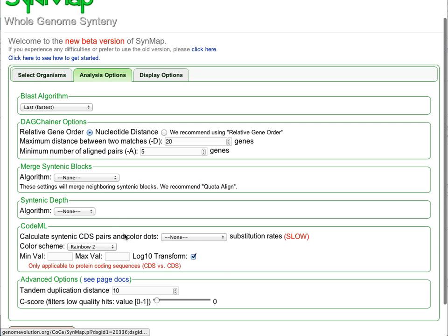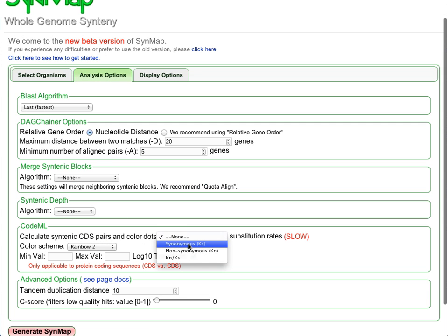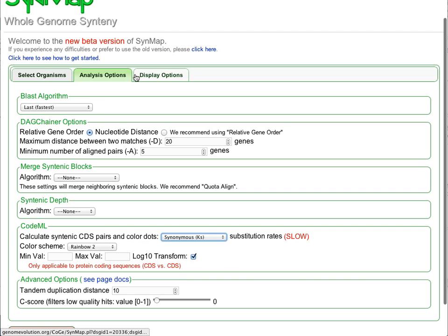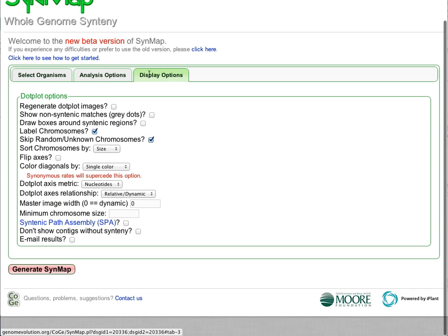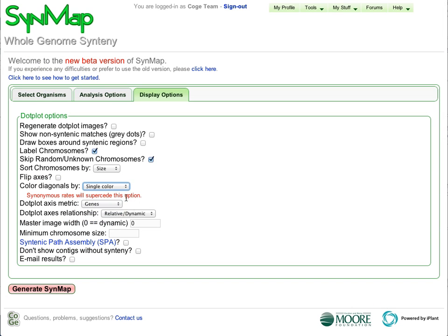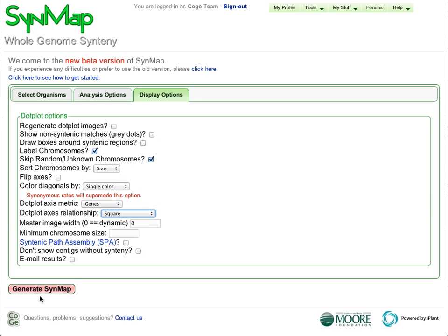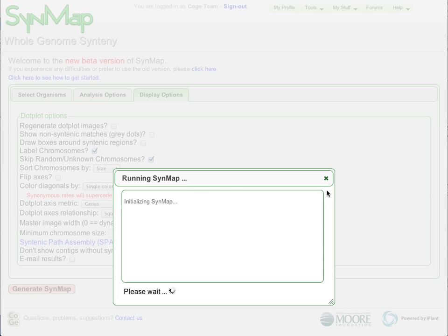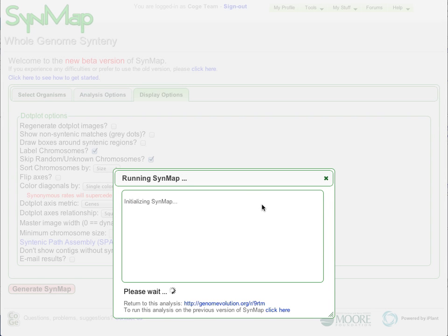And we're also going to turn on some advanced visualization, including being able to calculate the synonymous mutation rates between identified syntenic gene pairs, as well as modify the visualization so that it fits better within this particular screen resolution.